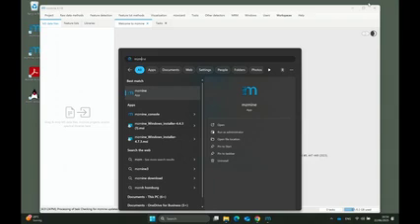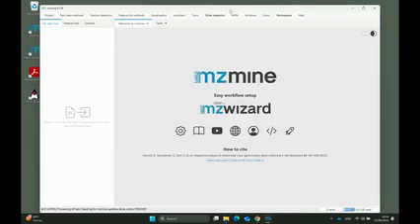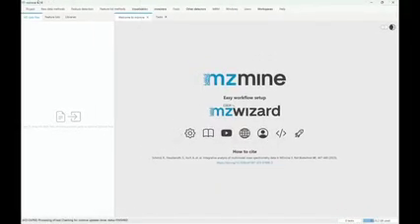This way you can also have multiple mzmine versions, just in case. Let's say you have an old study that was done with mzmine 4 point something, and you want to update for your new study, but also keep the old version in case you need to reprocess and really have the same results. And so you boot up mzmine, and the latest version is 4.7.8.